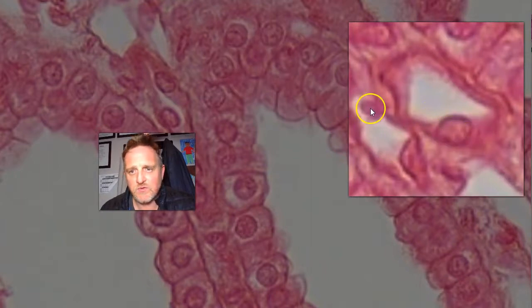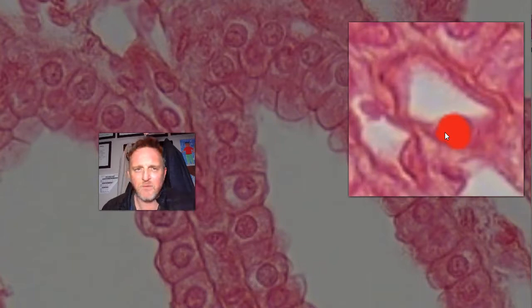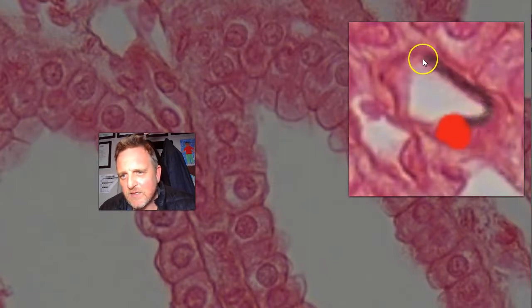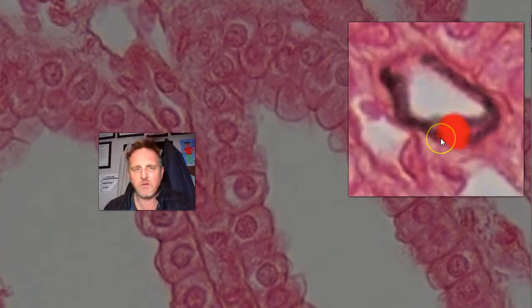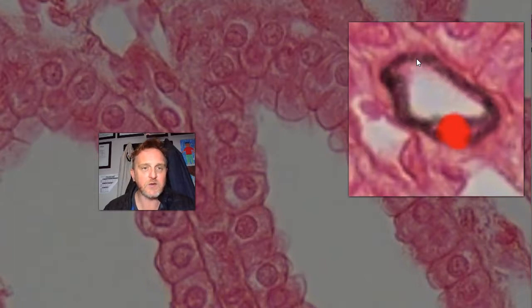What we can distinguish for sure is, and we can go color it in, is that guy. That's the nucleus of the flattened squame. And then biological extension, right? It's like, duh. I can't believe I just said that. You can deduce that that must be its cytoplasmic extensions on the side, right? Coming round. That typical squamous, where it tapers around and even possibly makes contact on the other side. Typical capillary morphology.